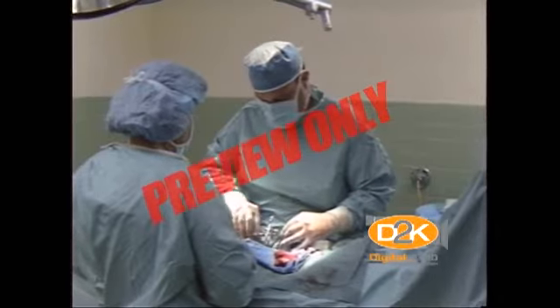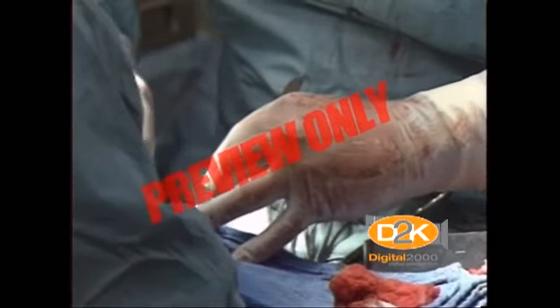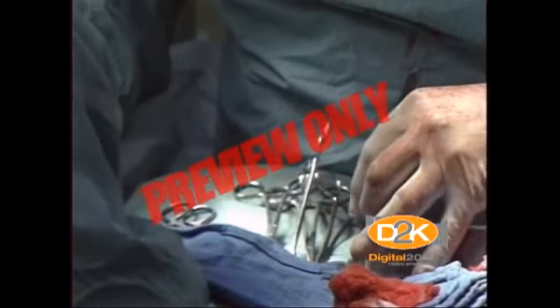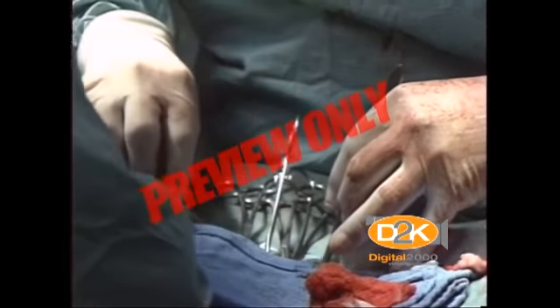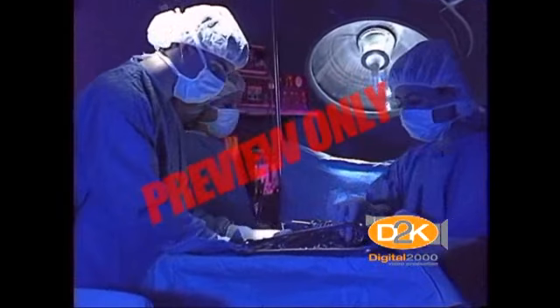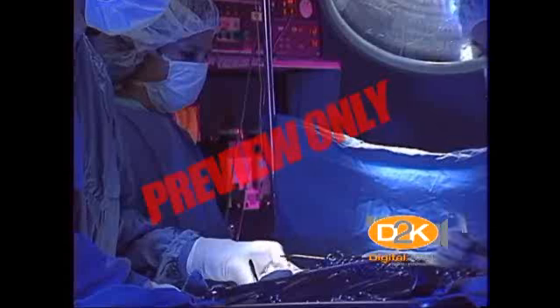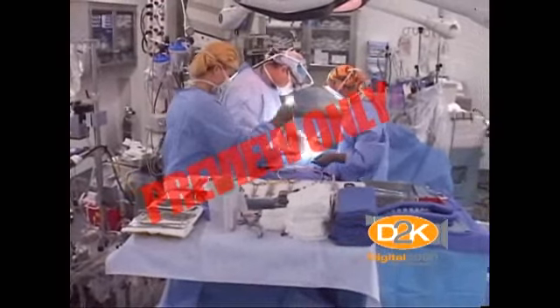Waste consisting of human blood or human body fluids, or items contaminated with human blood or human body fluids, all human anatomical waste, and all wastes that are human tissues, organs, or body parts are treated as regulated medical waste. All needles, syringes with attached needles, suture needles, and scalpels, including all sharps generated through veterinary practice likely to be contaminated with agents that are pathogenic to healthy humans, are regulated medical waste.